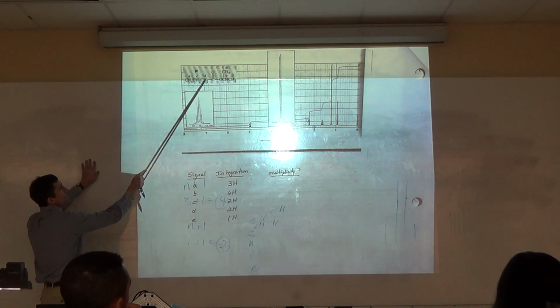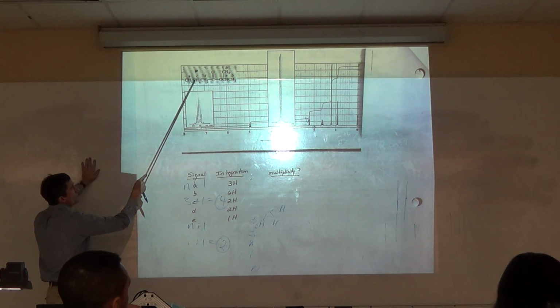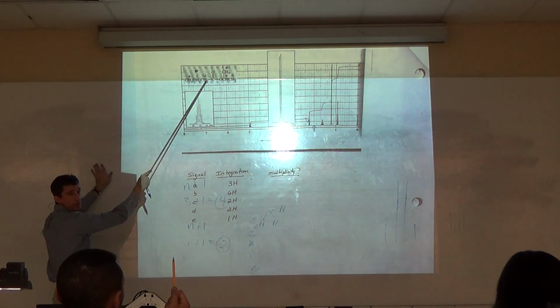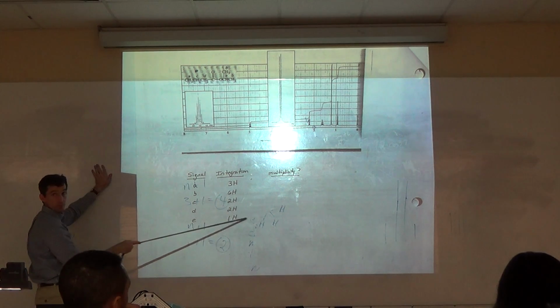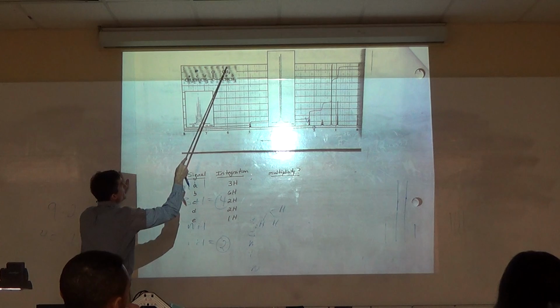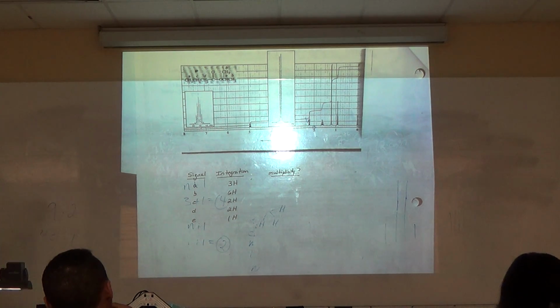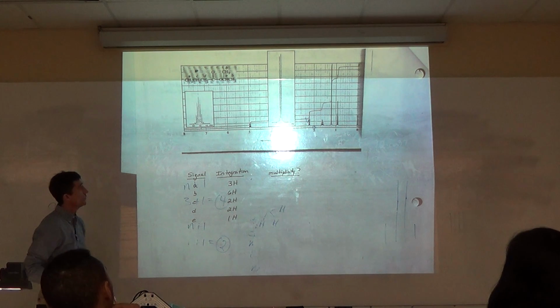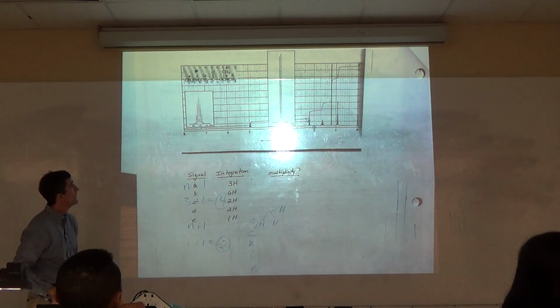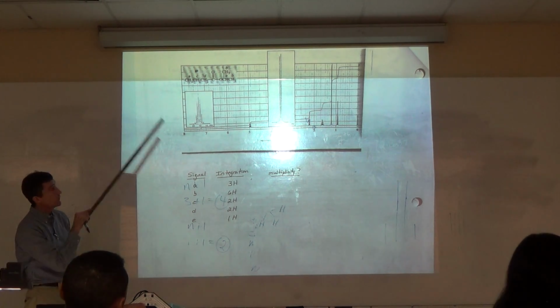How many neighbors within 3 sigma bonds? 2. N plus 1 is 3. Triplet. D should be triplet. Is that what we got? B. How many H's within 3 sigma bonds? 1. So N plus 1 is 2. What do we have for B? Doublet.